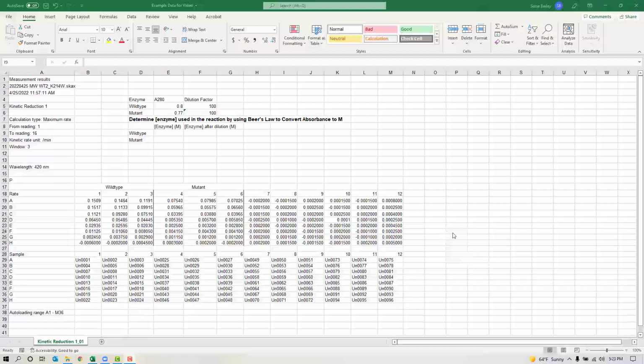In this video, I'm going to walk you through the steps that you need to go through to analyze your data from the Enzyme Activity Lab and build your Michaelis Menten curve so that you can come to some conclusions regarding the effect of your mutation on the activity of this enzyme, BglB.